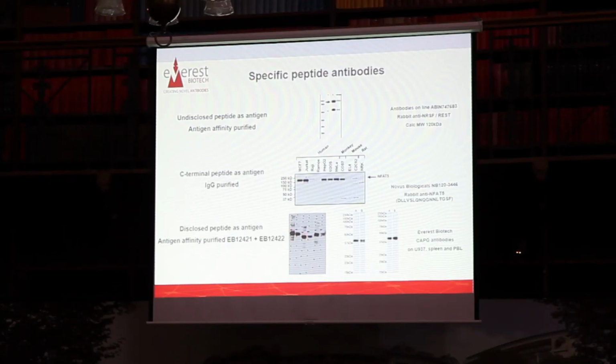What is so important about this piece of data is that it demonstrates nicely how the antibody is fit for an X number of cell lines, but not for all. There are also cell types or cell lines where the antibody is not fit. But do you see a lack of bands there? No, there are bands there as well, but much fainter, and not necessarily at the same molecular weight. These are non-specific signals. And you can only distinguish the non-specific signals once they are compared in the same blot with the specific signals in those cell lines that are fit to be looked at with this particular antibody.